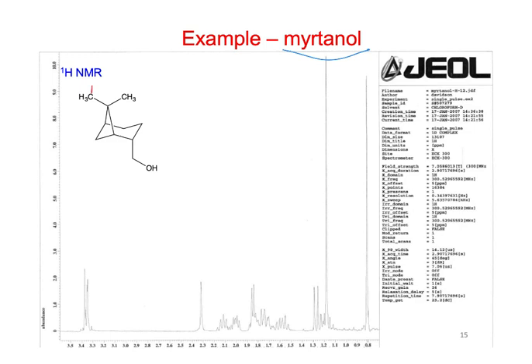if we start where there's this gem dimethyl, 1, 2, 3, 4, 1, 2, 3, 4, 1, 2, 3, 4. So in this case, on position 2, what would be a methyl has been oxidized to an alcohol, but it has that branch at the 2 position.